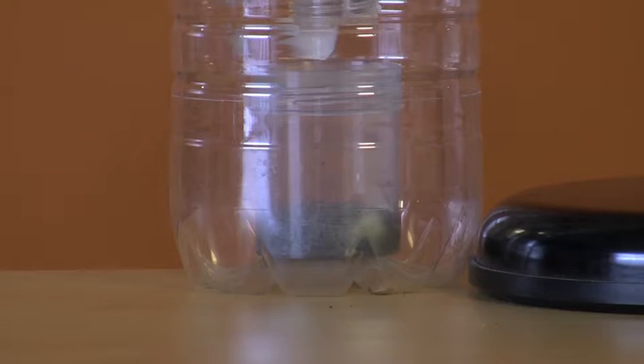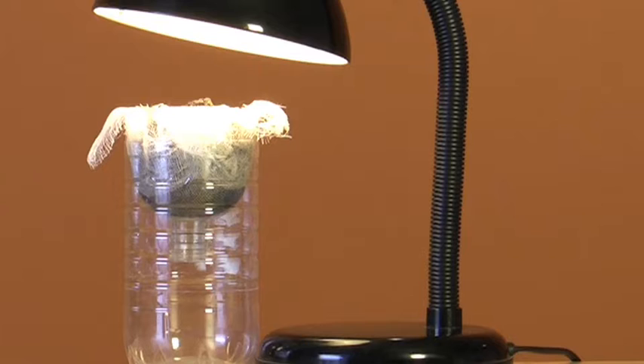Over the next few days, soil animals will gradually fall into the collecting container. I'd recommend letting it run for 3 to 5 days. If you're worried about leaving the light unattended, just switch it off at the end of the day and run the extraction for longer.